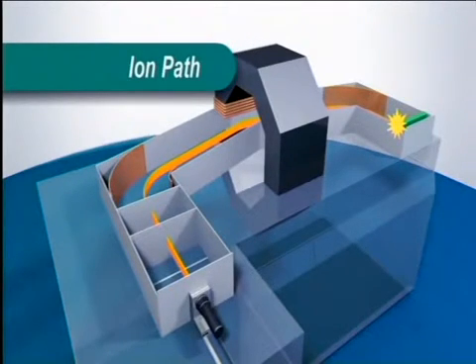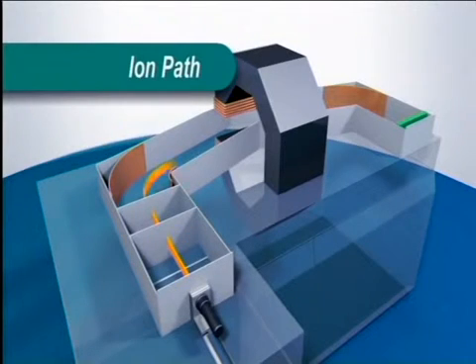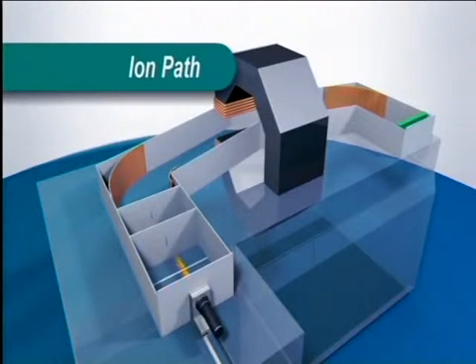The amount of deflection by the magnetic field depends on the mass of the ion, strictly its mass-to-charge ratio, but the vast majority of ions have only a single charge. The deflection also depends on the strength of the field. Heavier ions will not be deflected sufficiently in the magnetic field to reach the detector. Lighter ions will be deflected too much. During a run, the magnetic field is gradually increased so that ions of successively greater mass enter the detector.